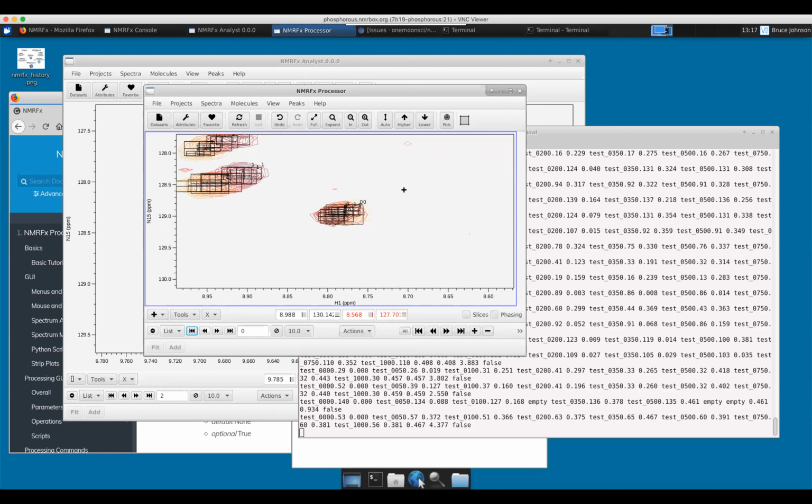But we've seen most of what it takes to set it up. Like I say, you'll get a nice XY plot. You can fit the titration curves. You can do a plot of all those curves. You can fit as many residues as you want. Each one you click the add button and it'll save it into a table. You can select whichever ones in the table you want to fit simultaneously to a KD. You can export that into a text file of a table and save a vector graphics image of the table.